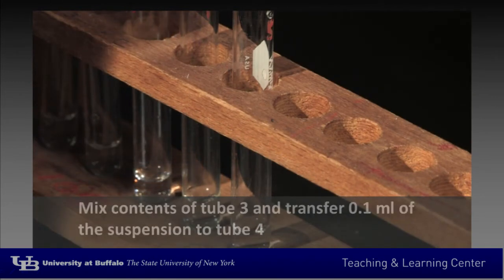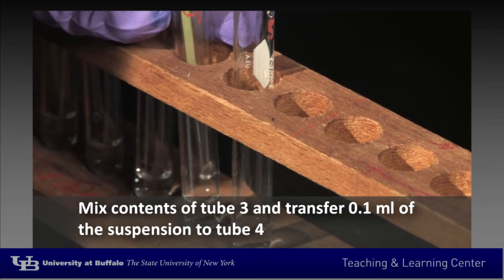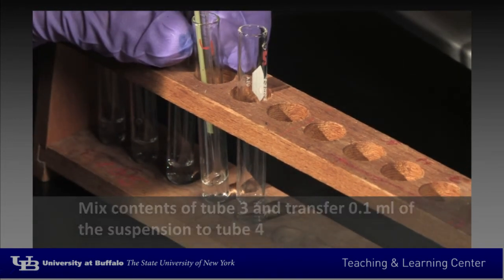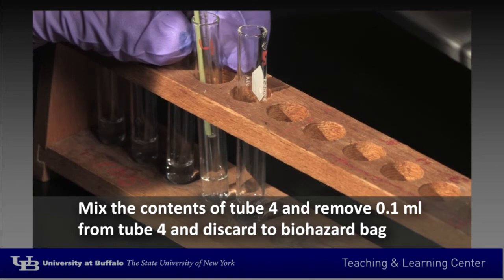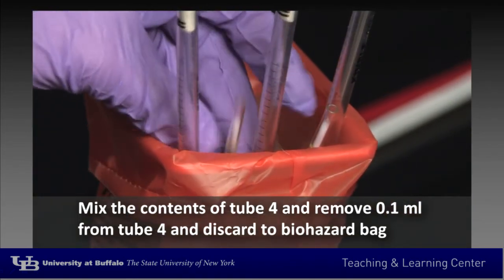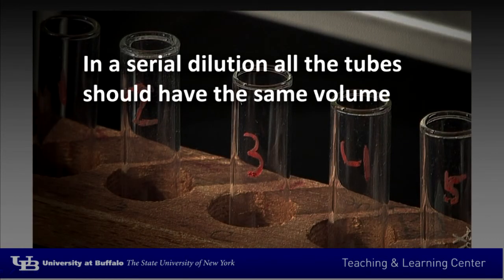Again, mix contents of tube number 3 thoroughly and transfer 0.1 ml of the suspension to tube number 4. Mix the contents of tube number 4 thoroughly and remove 0.1 ml from tube number 4 and discard the contents with the pipette in the biohazard bag. In a serial dilution, all the tubes should have the same volume.